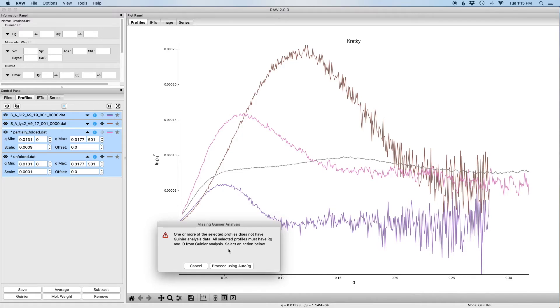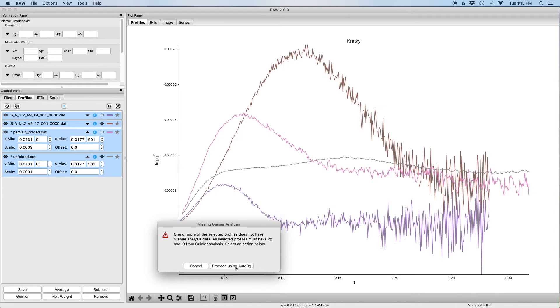Now ideally when you do this you've already done Guinier analysis on all the profiles. Here we've done Guinier analysis on the GI and the lysozyme profiles, but we haven't done it for the partially folded and unfolded data. So what we see is we get this window that says missing Guinier analysis. We can either proceed using an automatic determination of the Guinier or we could cancel and do the Guinier manually. I'm going to proceed using the automatic determination.